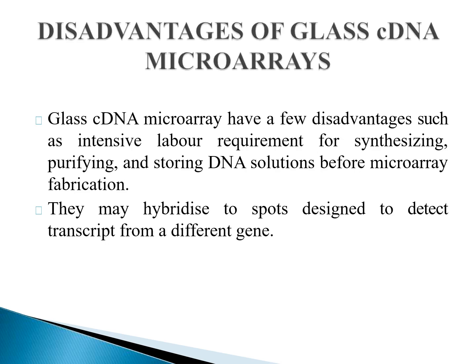Then disadvantages of glass cDNA microarray. It has a few disadvantages such as intensive labor requirement for synthesizing, purifying and storing DNA solution before microarray fabrication. So for this glass cDNA microarray, you have to prepare the cDNA molecules, or you have to amplify the DNA with the help of PCR, or you have to chemically synthesize the DNA molecule. And that is a very labor intensive job, synthesizing, purifying and storing the DNA solution. So that is one of the disadvantages of glass cDNA microarray.